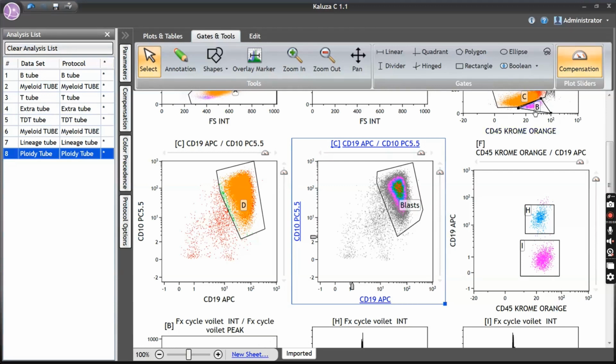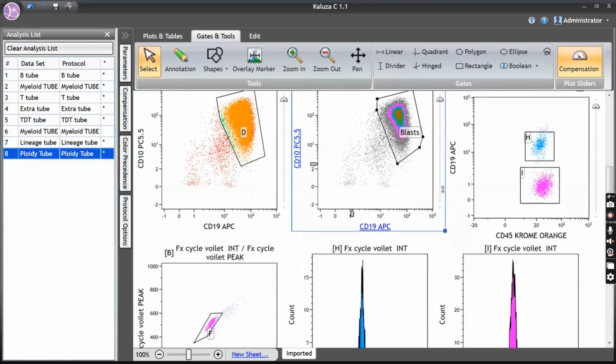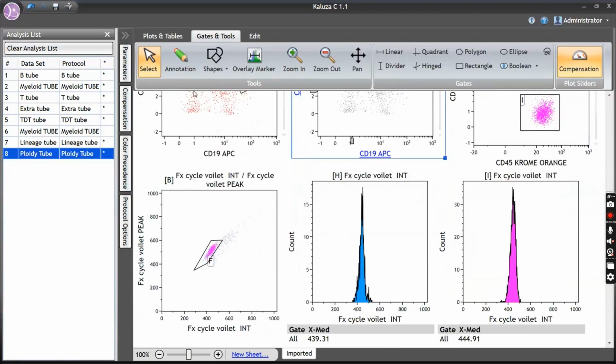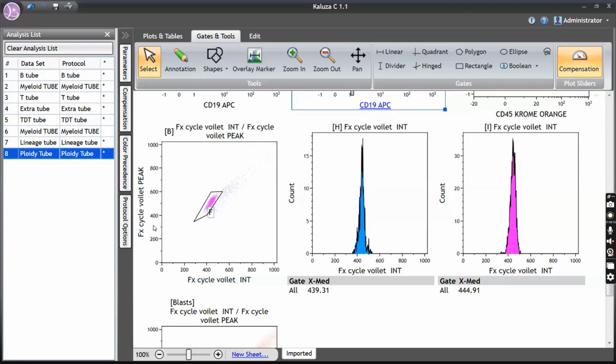So you got the lymphocytes, and now again what I'm doing is applying the lymphocyte gate as we do for singlets. I'm using this particular dye to discriminate the population and refine it into a cluster. This plot, I suppose you didn't understand. After getting the lymphocytes, I'm applying them in this plot, which is something like a singlet plot.